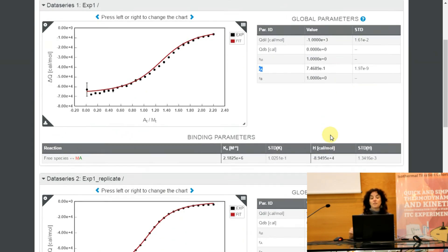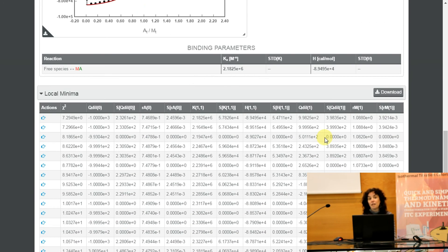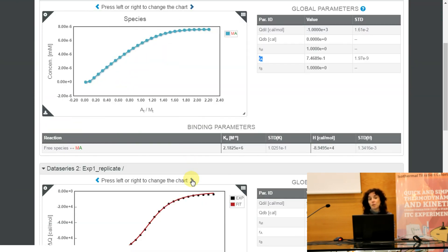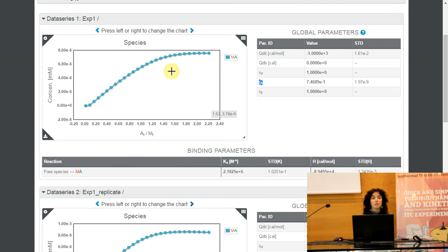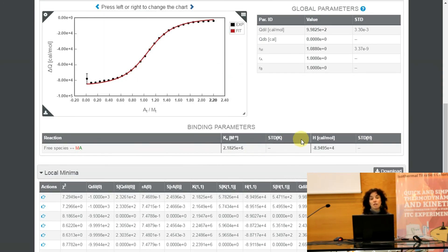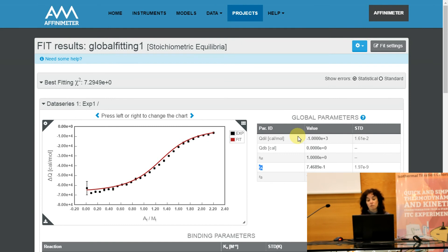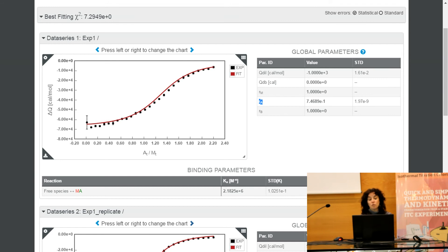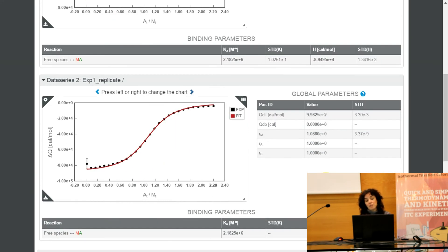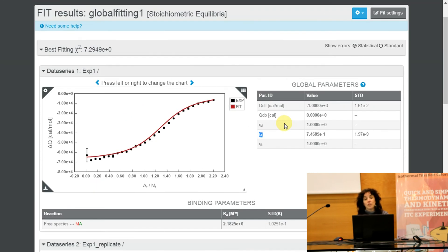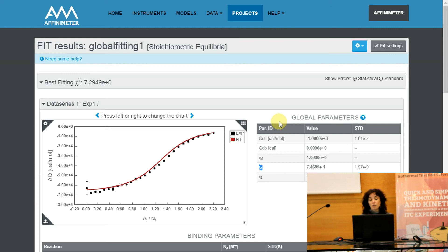So this is an illustrative example of how global fitting can help even for a simple case such as a one-to-one interaction with duplicate experiments. If we had performed this experiment separately, we would have obtained good fitting in both individual analyses but with different binding constants and enthalpy for each case, due to the deviation in the concentration of species A in one of the isotherms. Only with global fitting were we able to figure out where this deviation was and obtain an accurate single value of k and delta h.